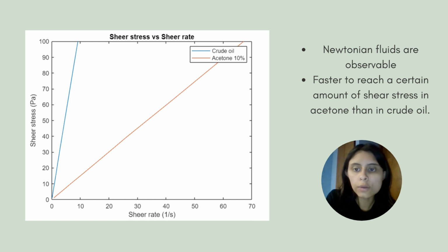From a molecular point of view, this shows that the shear stress that is applied to the oil does not affect the bonds of the asphaltenes. Now, when we add the acetone, it is seen that it will create an easier manipulation of the oil and will most likely debilitate the bonds of the asphaltenes.